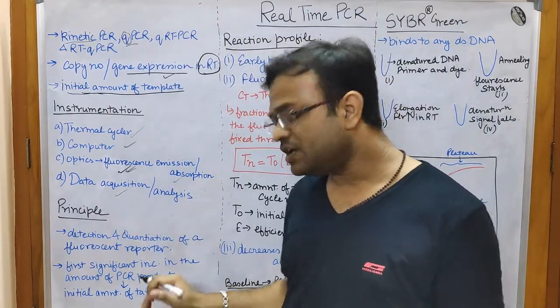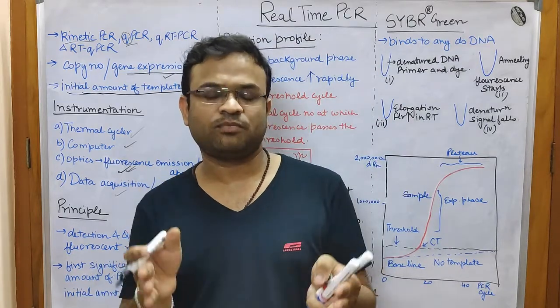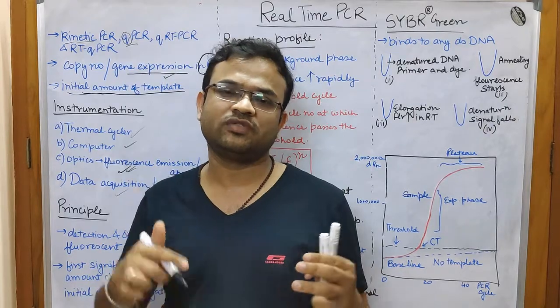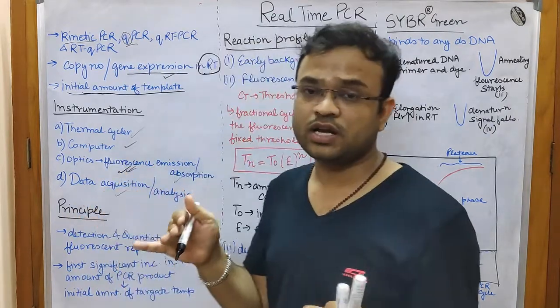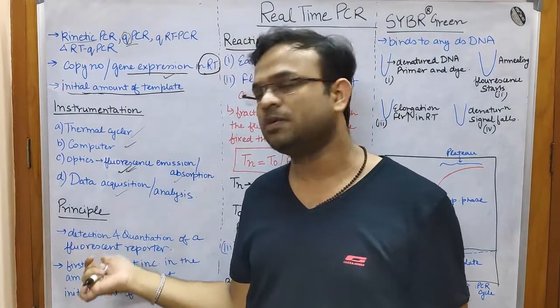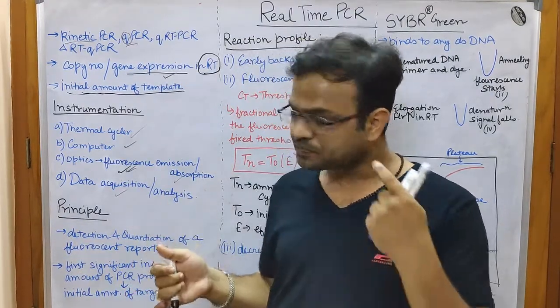of the product that was present. It would lead to the determination of the initial amount of that particular gene that was expressed. So this is what the principle actually is.